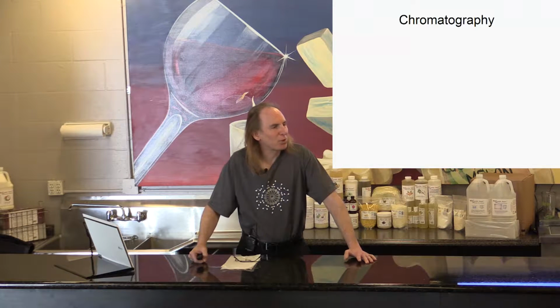All right, there's the word. A terrible polysyllabic word, and I want you to at least appear to be intelligent, and the first step is even being able to pronounce a word like this. So this is chromatography. Chromatography. Let's practice it. Chromatography. Chromatography. If you're going to talk to people about chromatography, you ought not to stumble over the word. So you might go to a dark corner somewhere and practice.